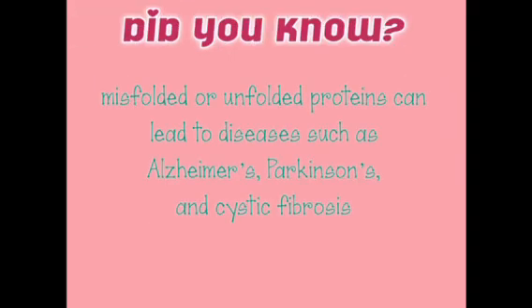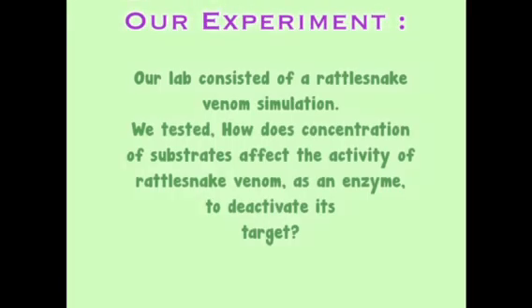Did you know? Misfolded or unfolded proteins can lead to diseases such as Alzheimer's, Parkinson's, and cystic fibrosis. Our experiment: our lab consisted of a rattlesnake venom simulation. We tested how the concentration of substrates affects the activity of rattlesnake venom as an enzyme to deactivate its target.